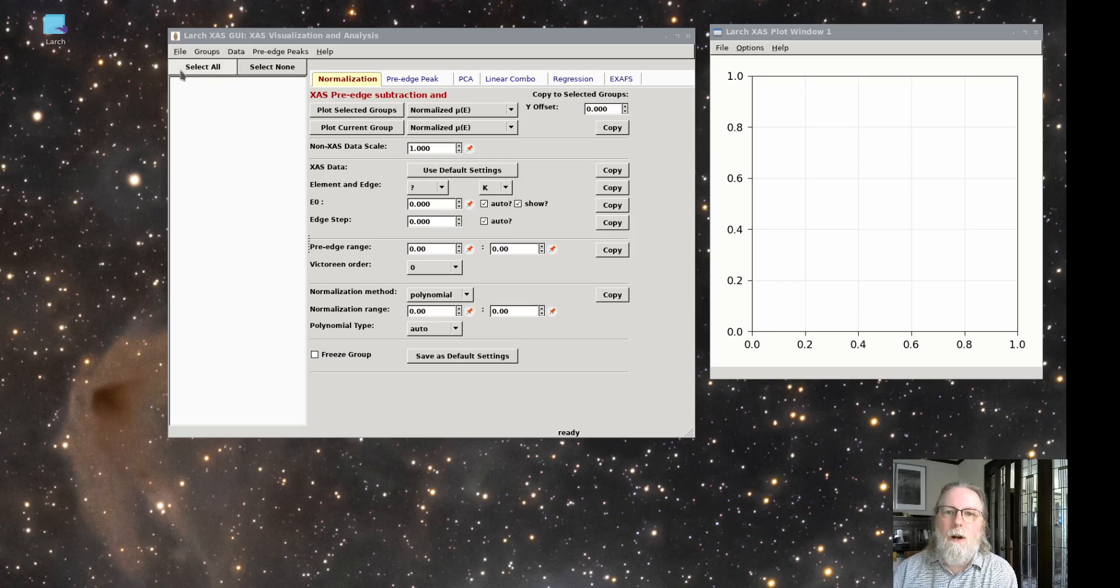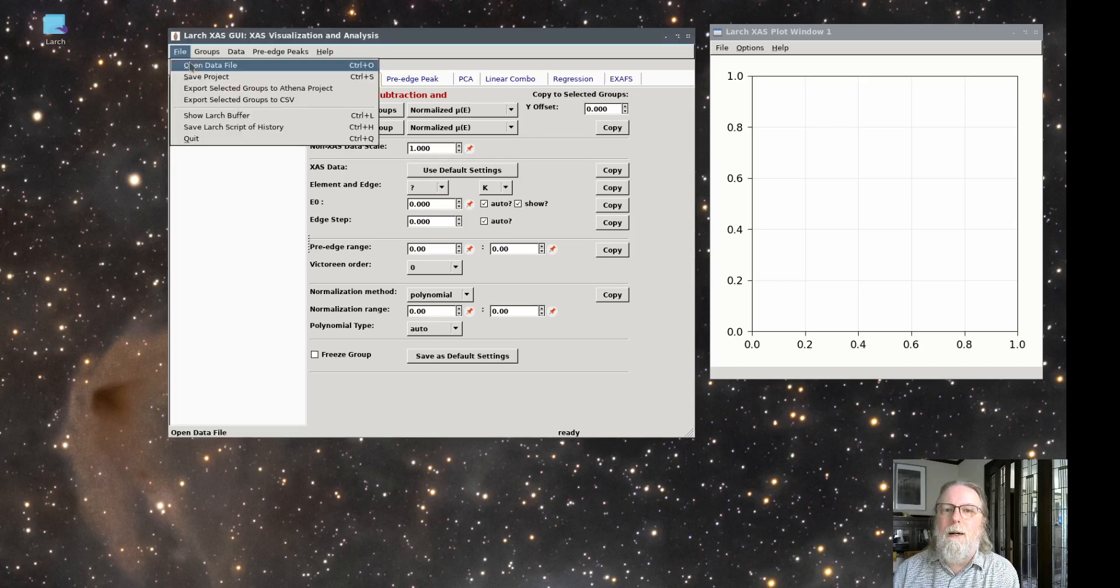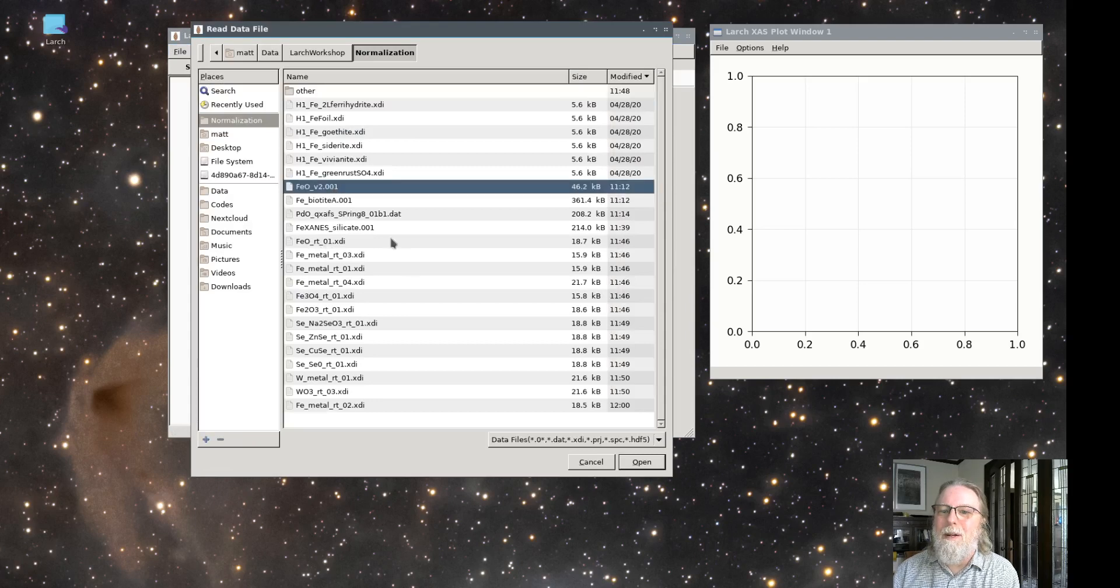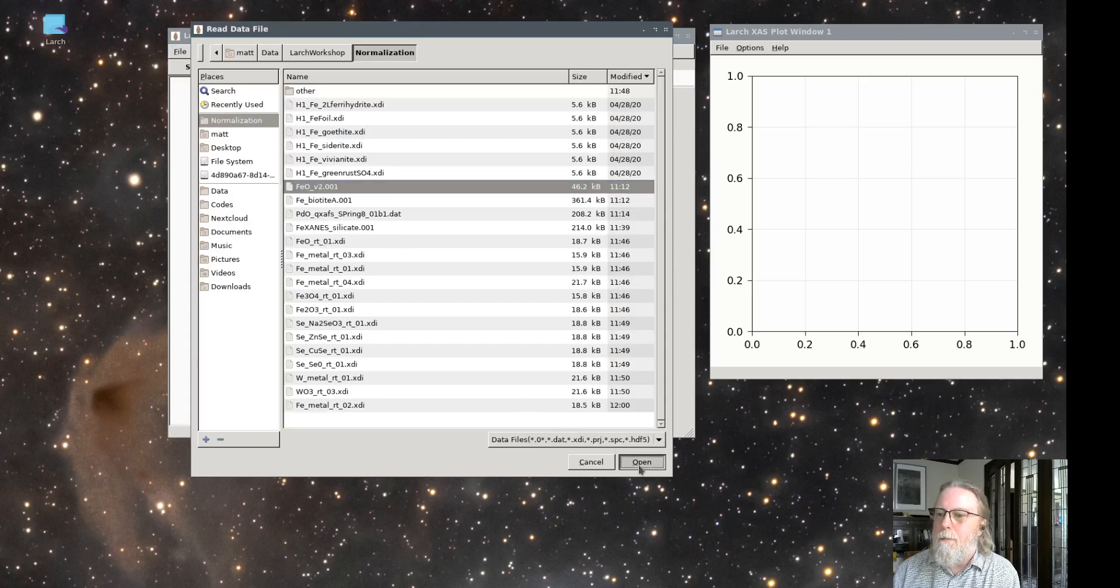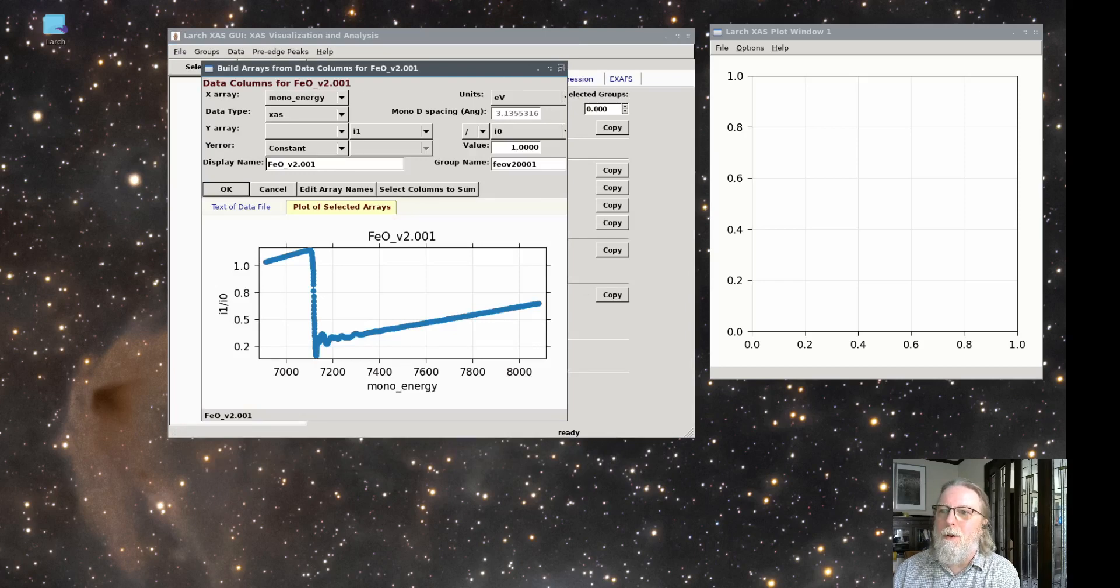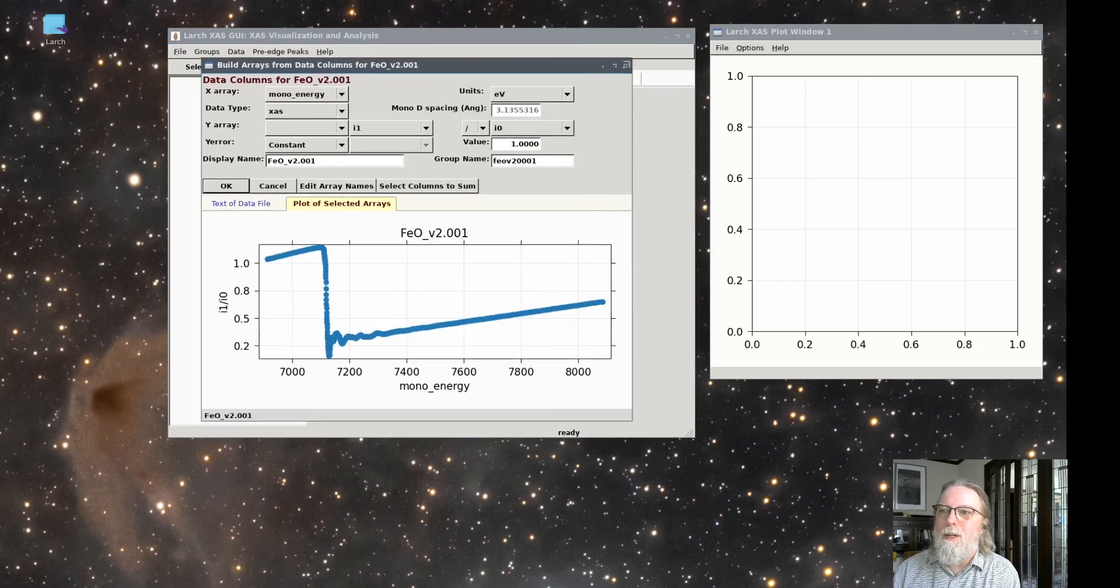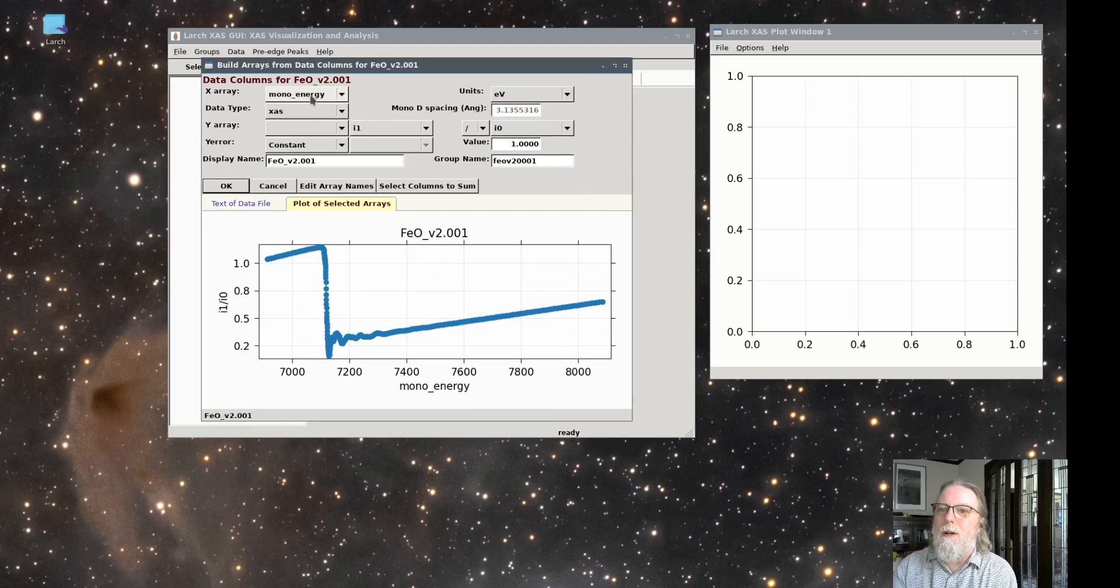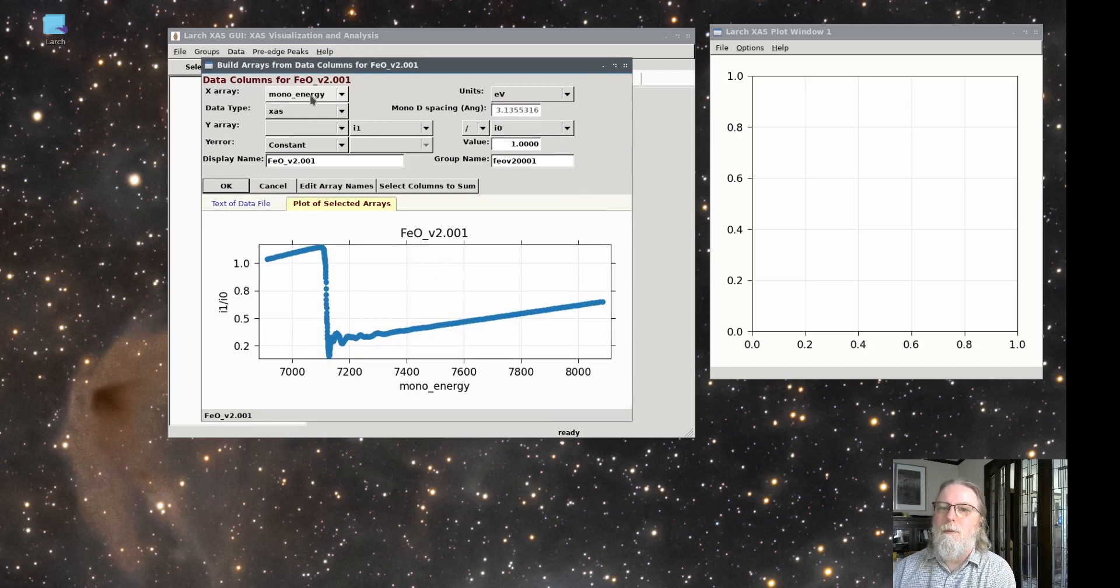So let's start by reading in some data. I'll start with some iron oxide data, one of my favorite examples. And we'll also go over as we do this, reading in several datasets just to get your feet wet for how to do this well. So here we've read in data.